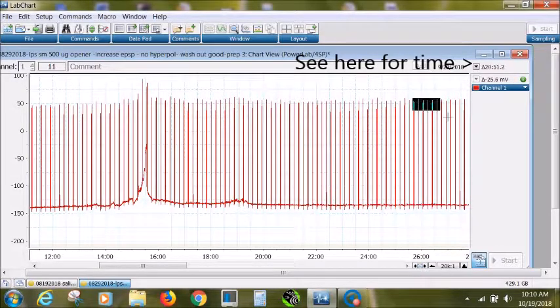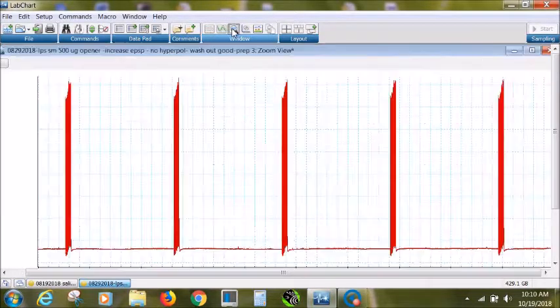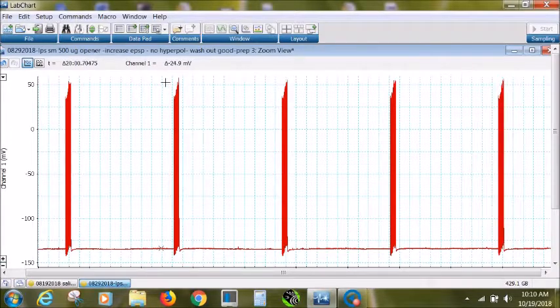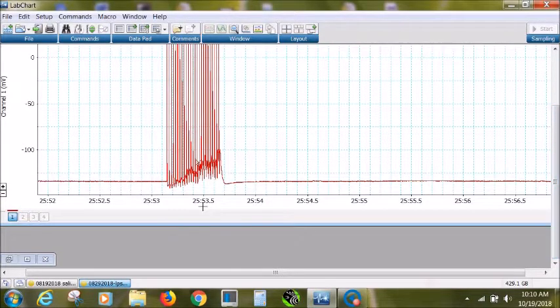And once again, we're going to zoom in quite a bit here. Just pick any one of these, it doesn't matter which one, as long as it's in the general area. And if you just write down this number here, that way you know which peaks you are using for each trial, and that'll just make it easier for people going back and checking your data.